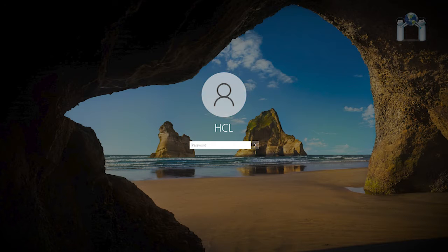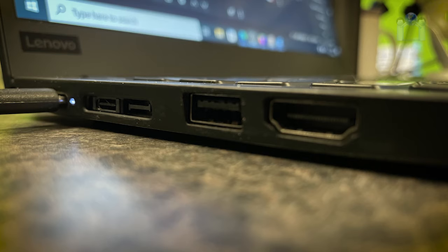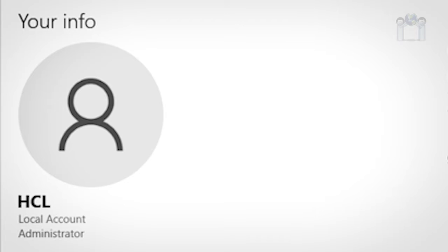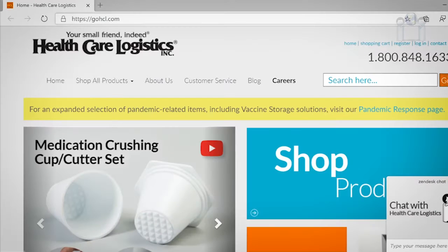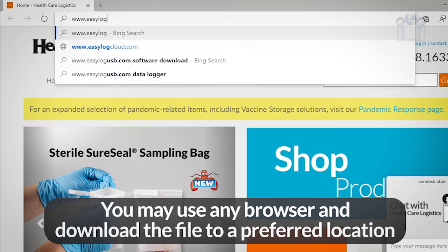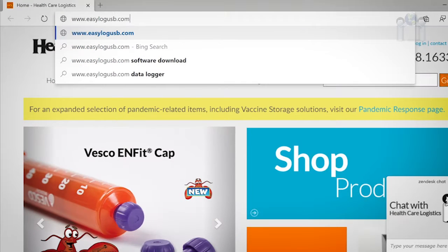To begin, log into a computer that you will use to connect the data logger to. Make sure a USB port is available and the computer is running Microsoft Windows. Also, make sure you have permissions on the computer to install software. Open a web browser — I will be using Microsoft Edge — and go to easylogusb.com.